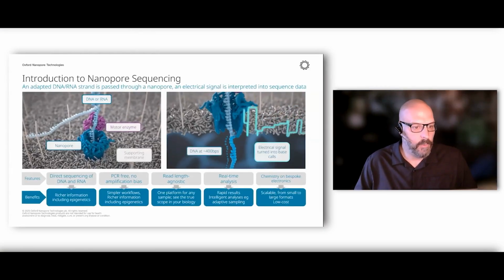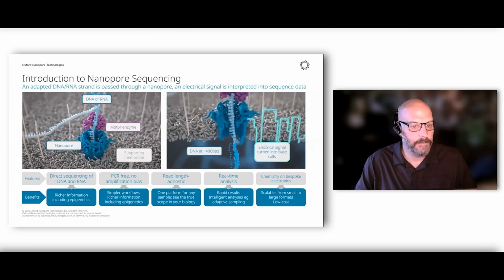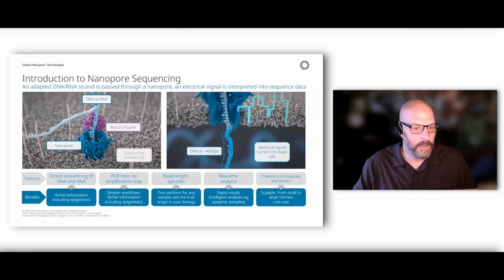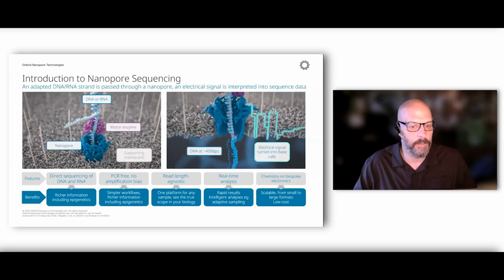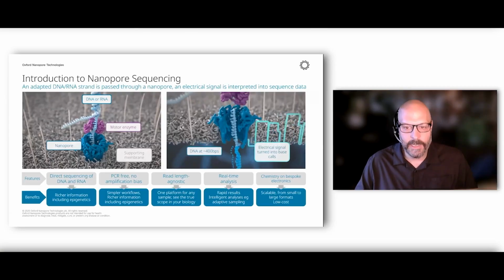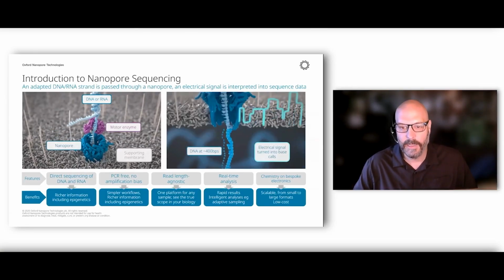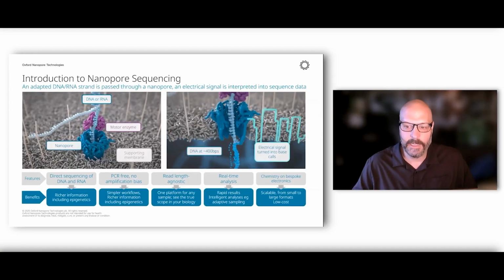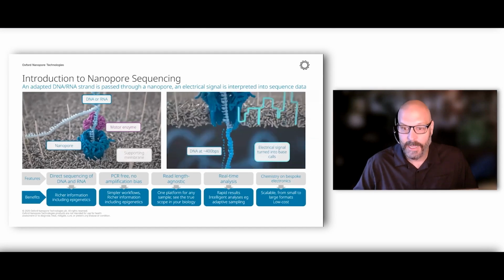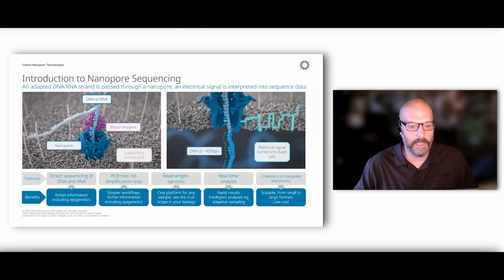Nanopore sequencing has 4 key components. On the left-hand screen here, you see the nanopore, which is in blue, the motor enzyme in purple, the DNA or RNA that's flowing through the nanopore with the help of the motor protein, and then the supporting membrane that houses the nanopore. On the right-hand side, you can see as the DNA is flowing through the pore at about 400 base pairs per second, it's turning the sequence of the DNA into an electrical signal that we can detect. And in the case of methylation, it is determining a different methylation signature versus a canonical base.